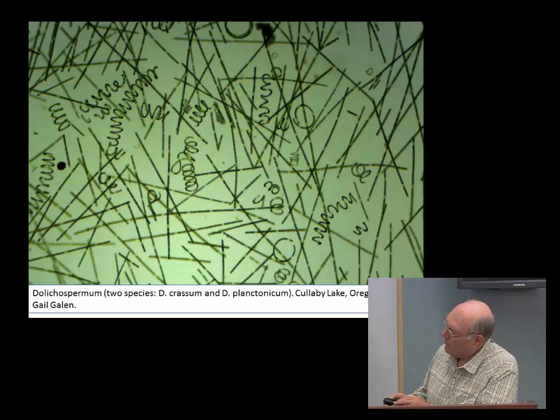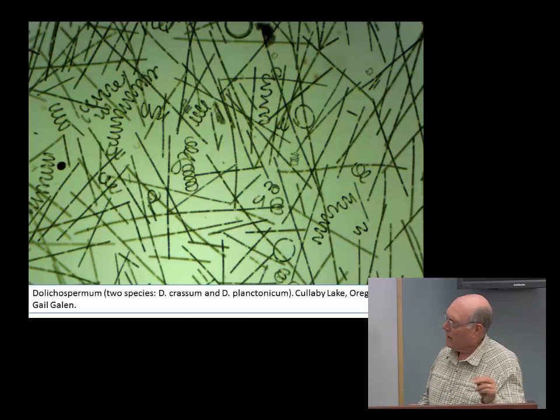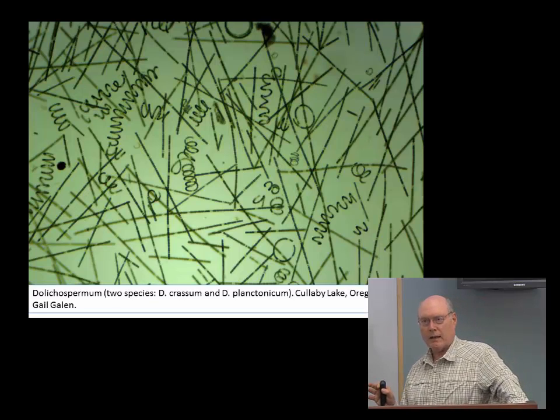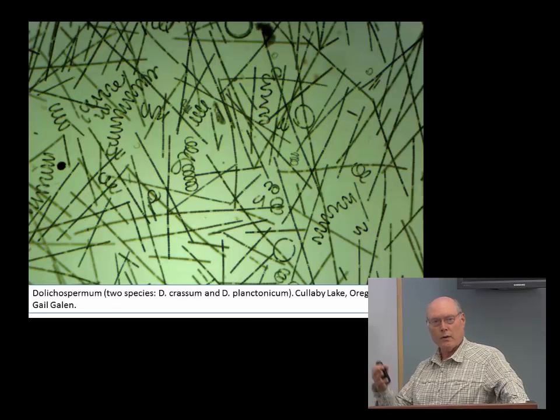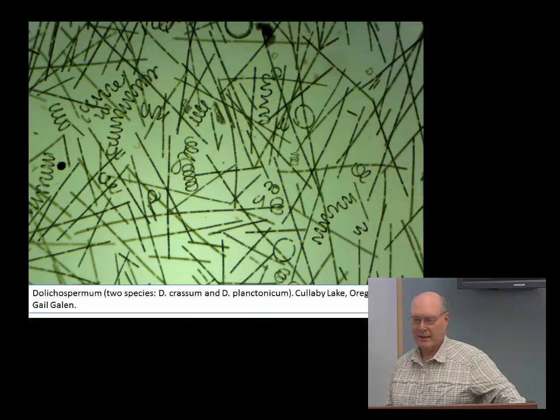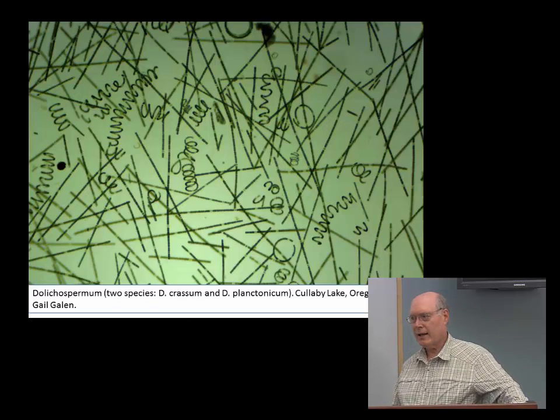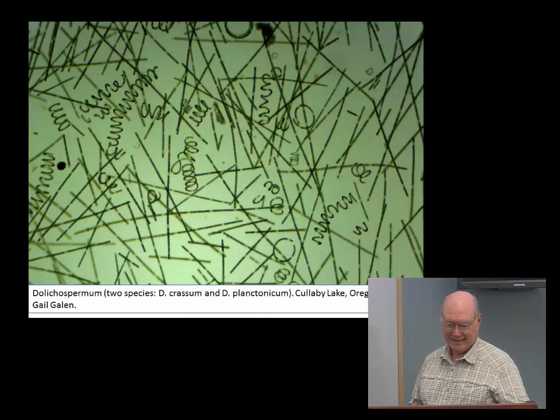And again, here, wherever you see a light dot, that's going to be one of those heterocysts, but I don't see any akinetes there. So that's the sample I'd like you to sit down with and walk through the key and prove to yourself that it's Anabaena. So I'm telling you the answer, so see if you can walk through the key. But it's not, it's Dolichospermum. Okay, Dolichospermum, yes. I told you I refused to.